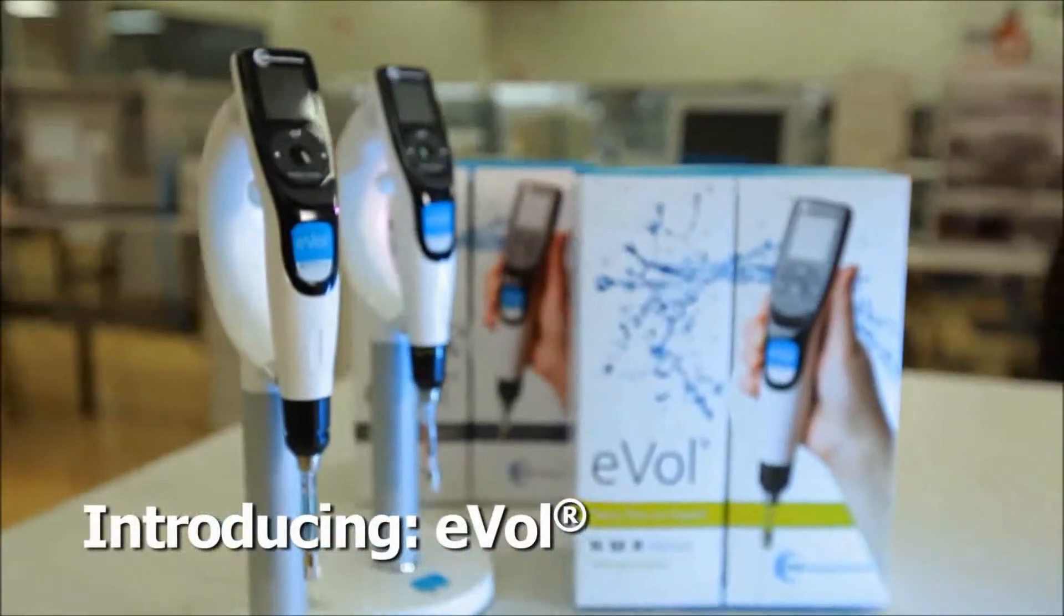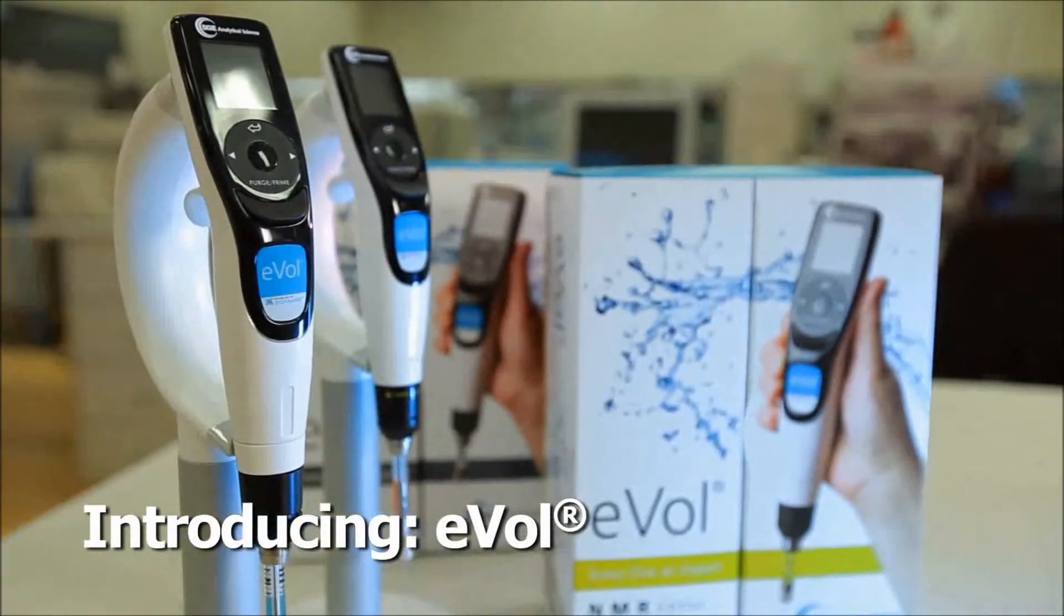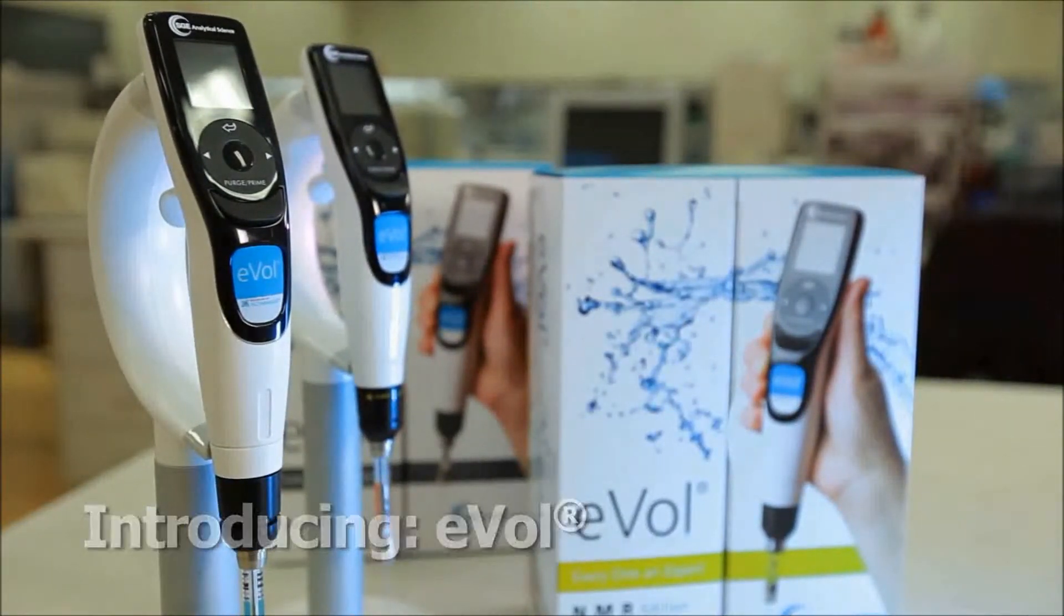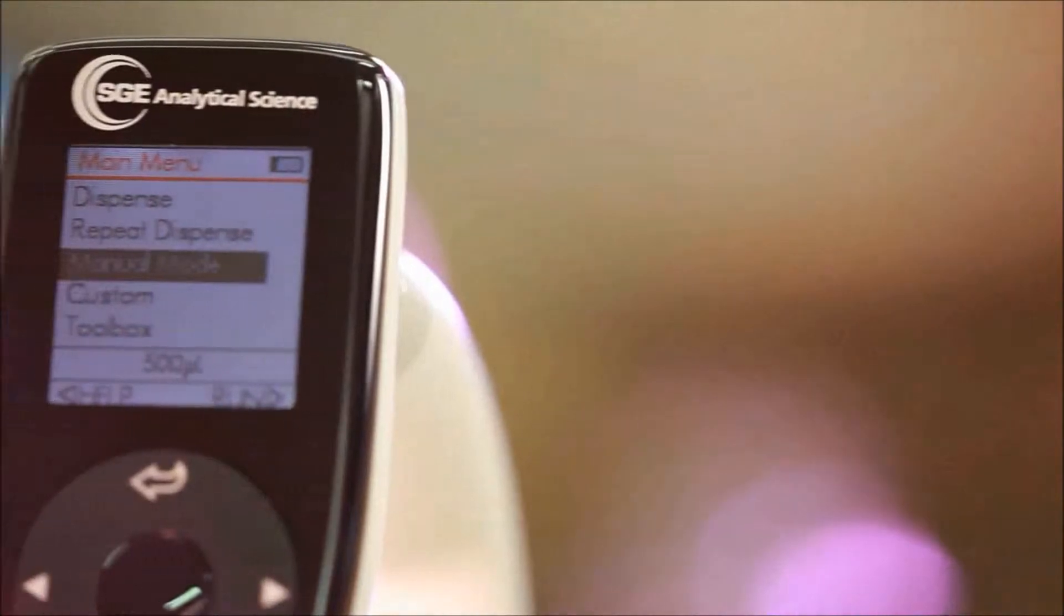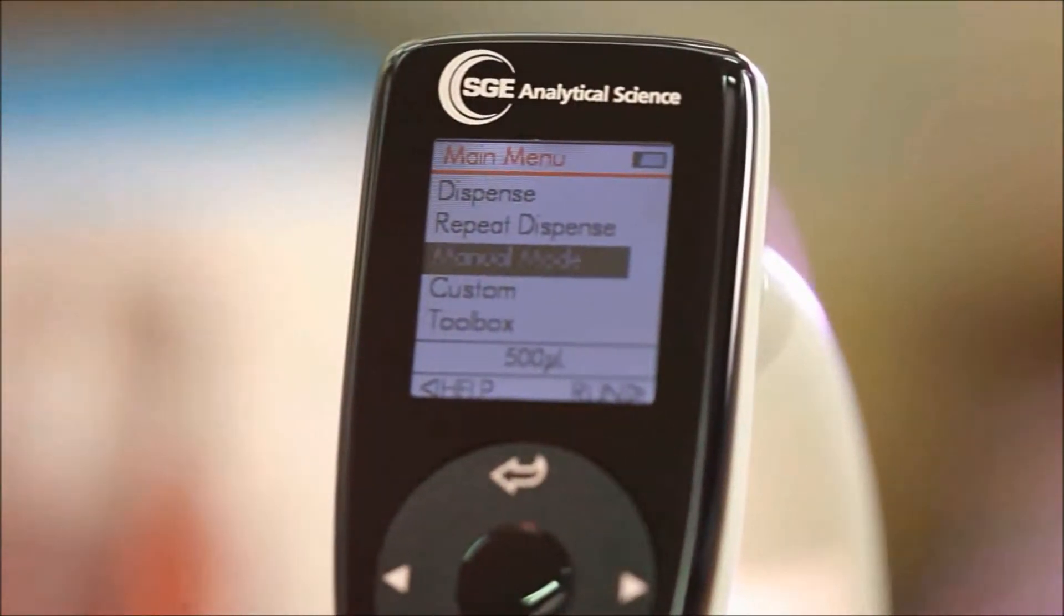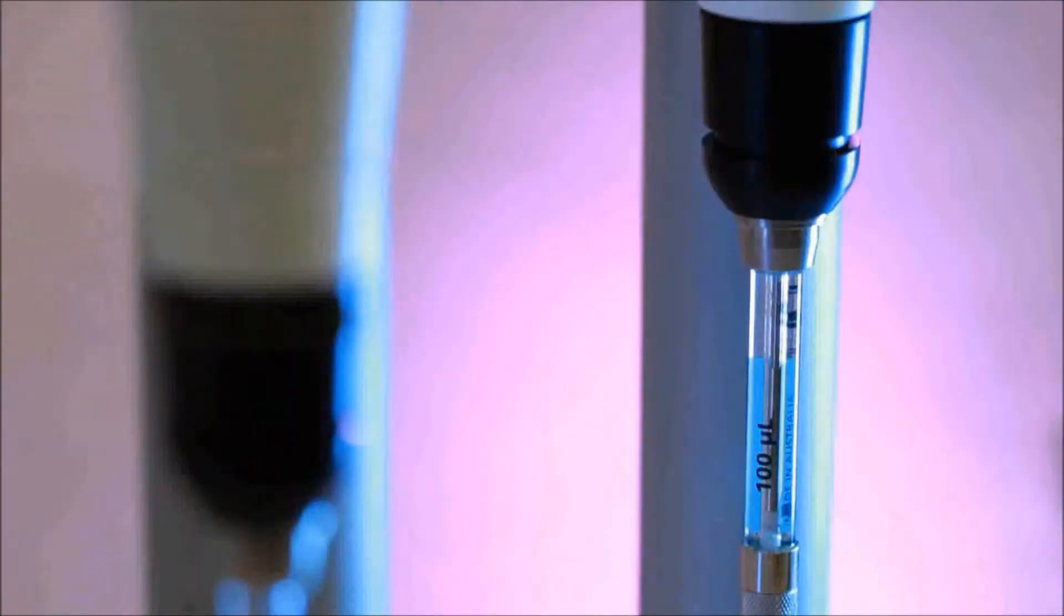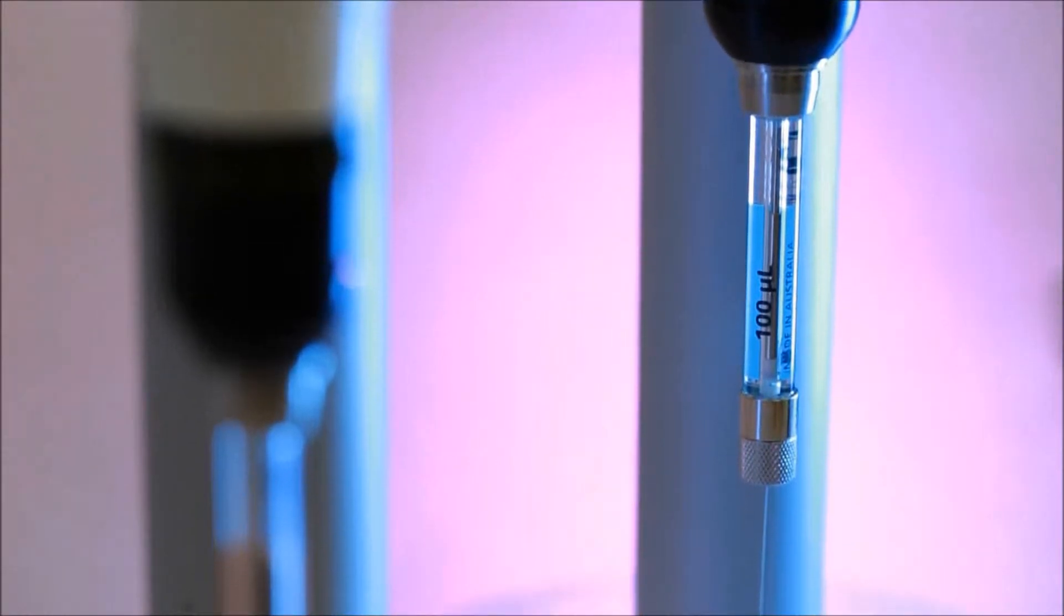SGE Analytical Science presents EVOL, the world's first digital analytical syringe, which couples two precision devices: a digitally controlled electronic drive and an exchange-enabled analytical syringe.